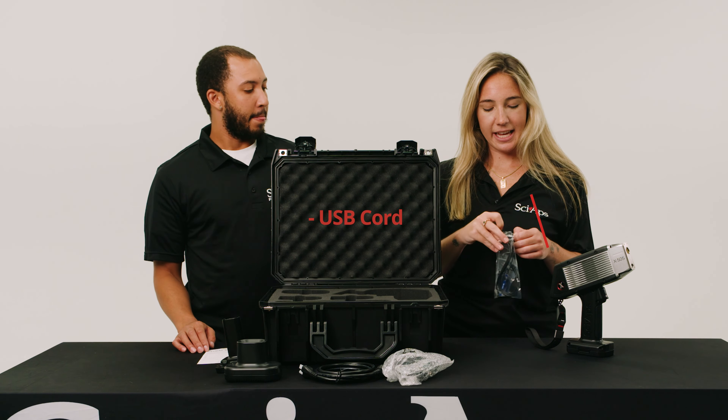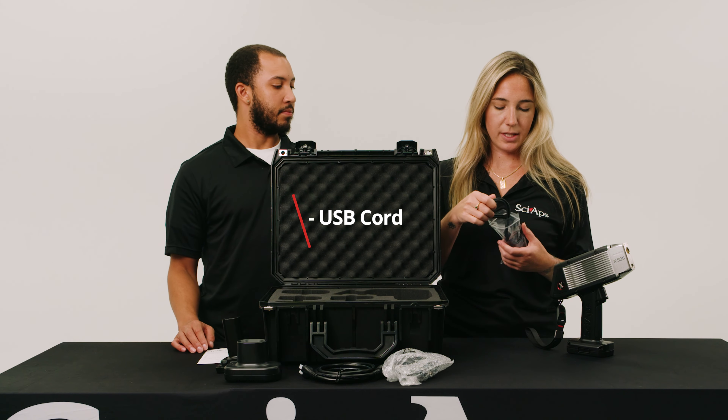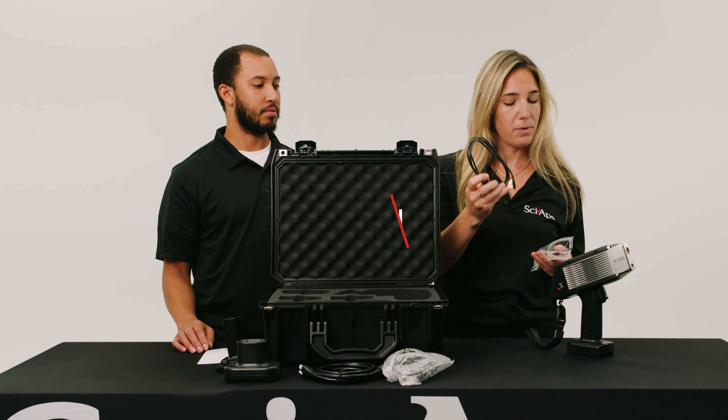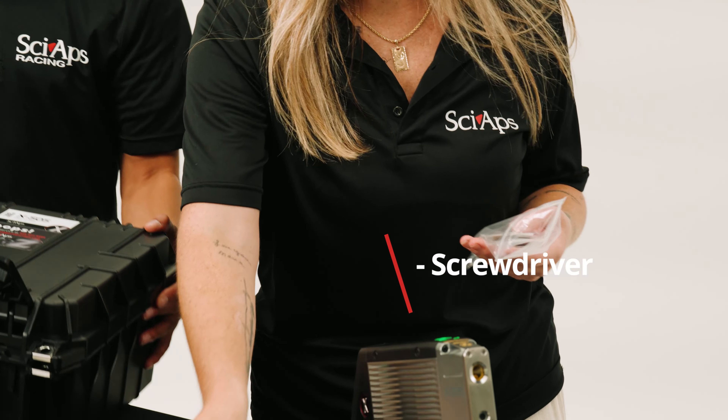You'll also receive this kit that includes your USB input so you can plug this into the computer and use profile builder, and a screwdriver if you want to remove the nose plate.